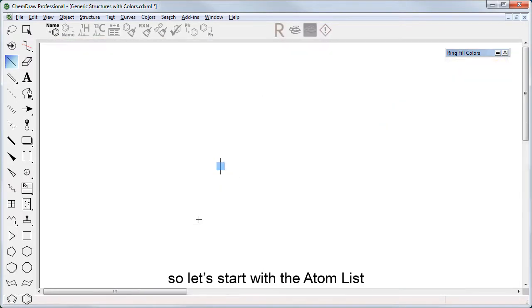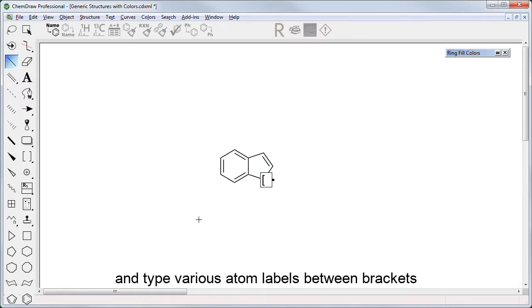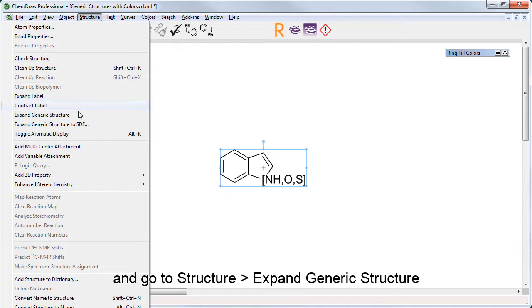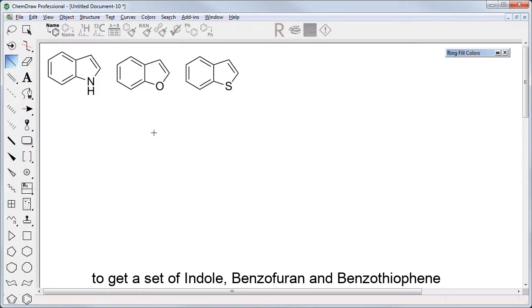You start the text tool over an atom and type various atom labels between brackets comma separated. You then select the structure and go to Structure, Expand Generic Structure to get a set of indole, benzofuran, and benzothiophene.